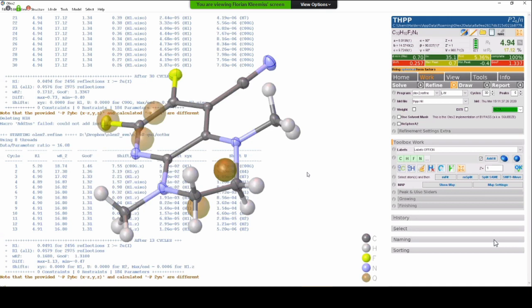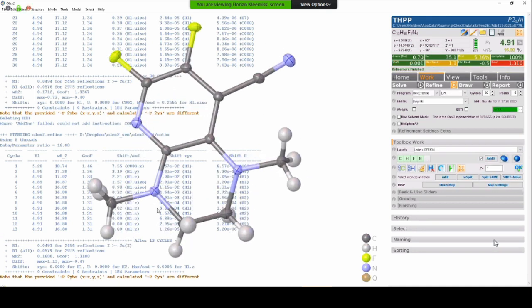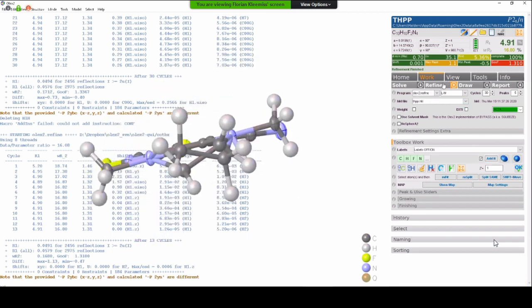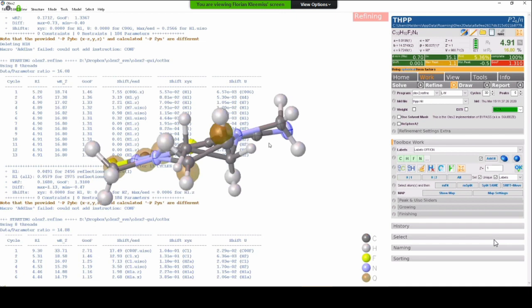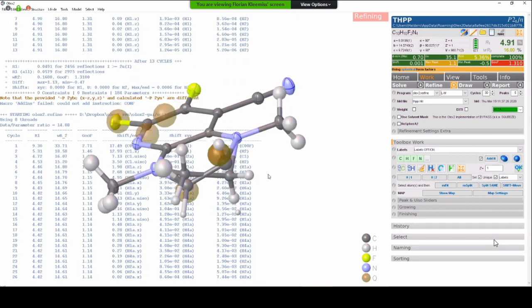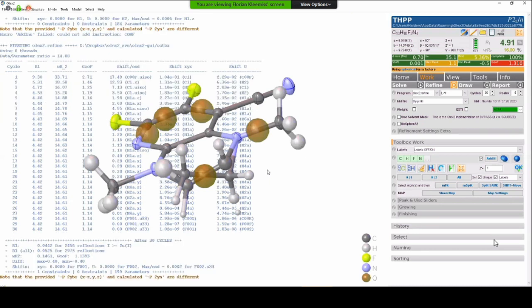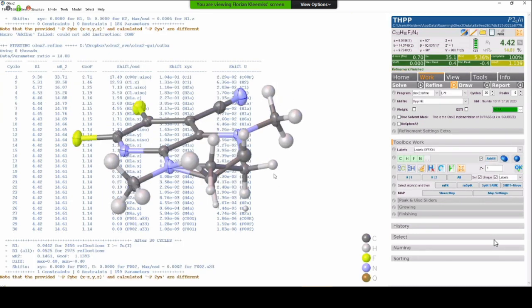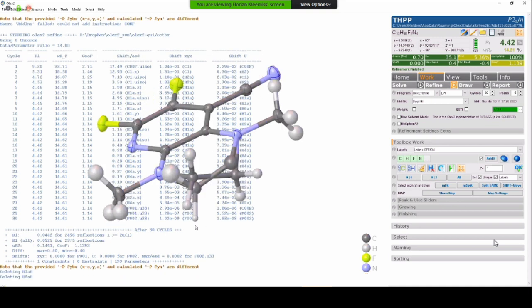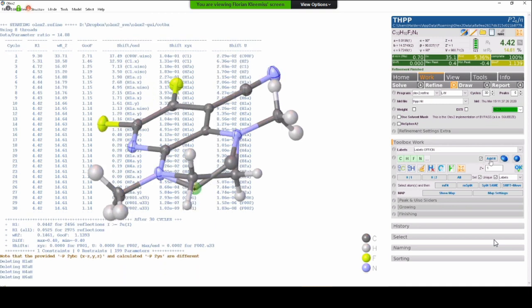And now I can maybe split this. Move this over here. So I have the second part. Okay, the hydrogen atoms go haywire. Well, it's sort of expected if you consider what I said previously. So why not add them with constraints?